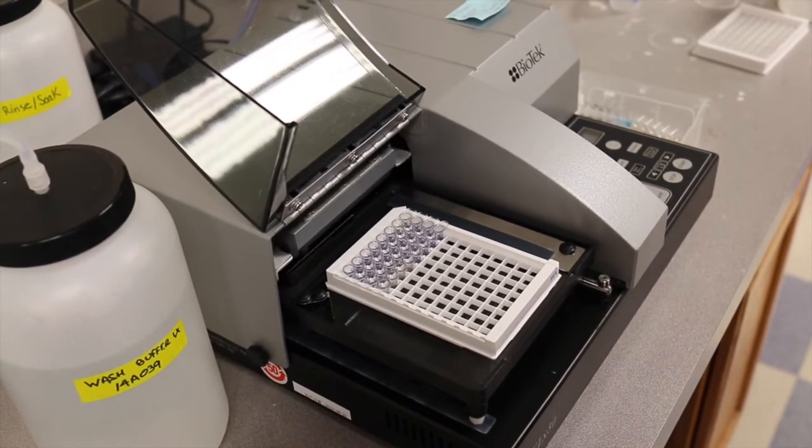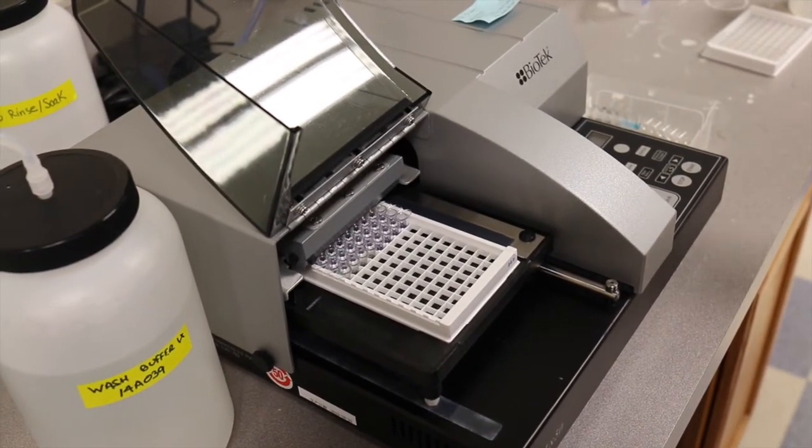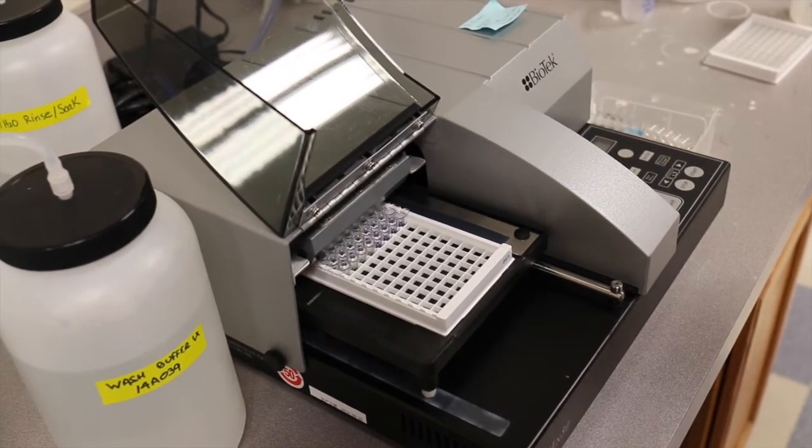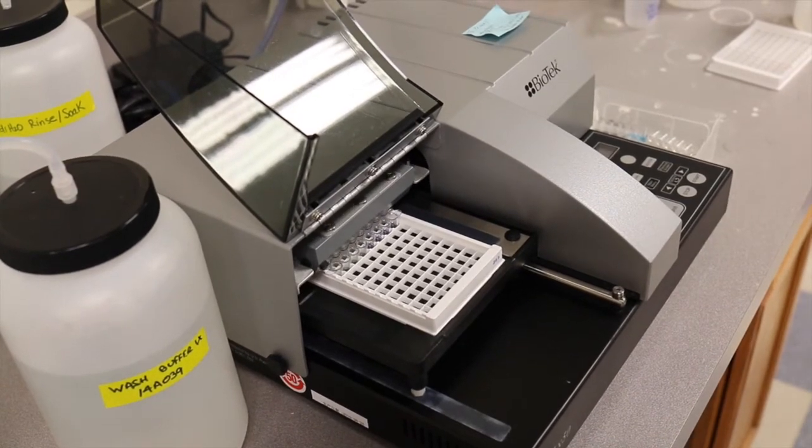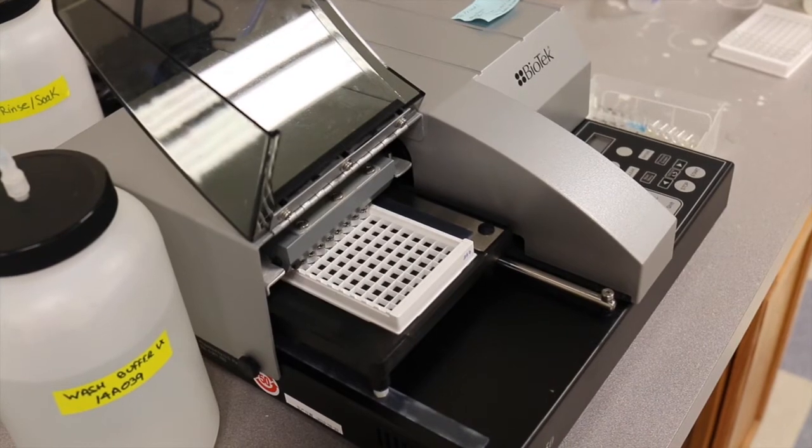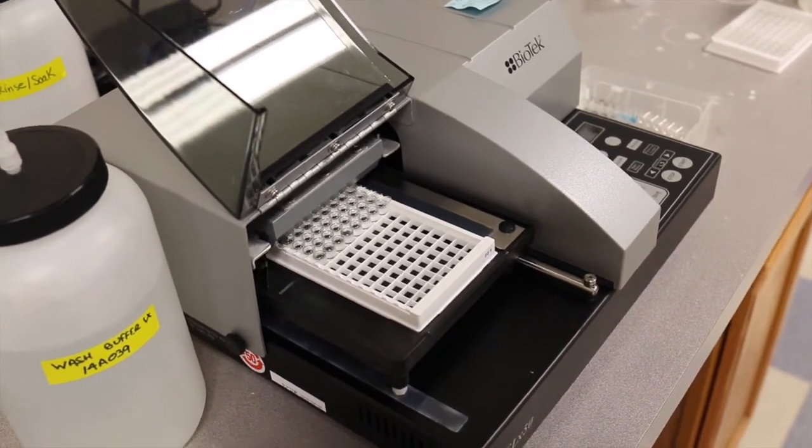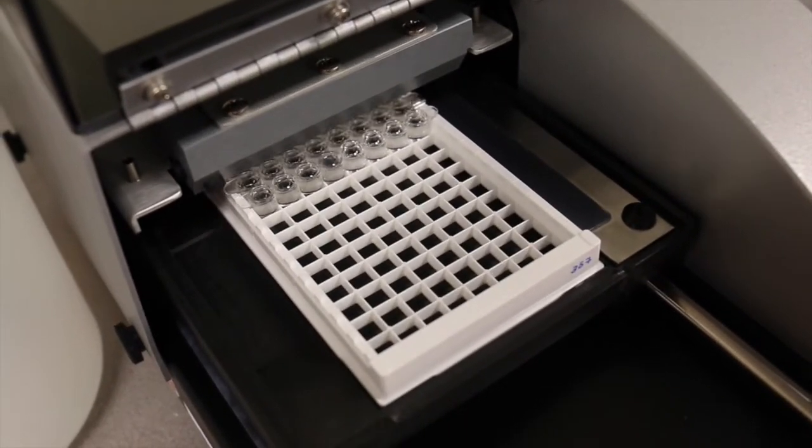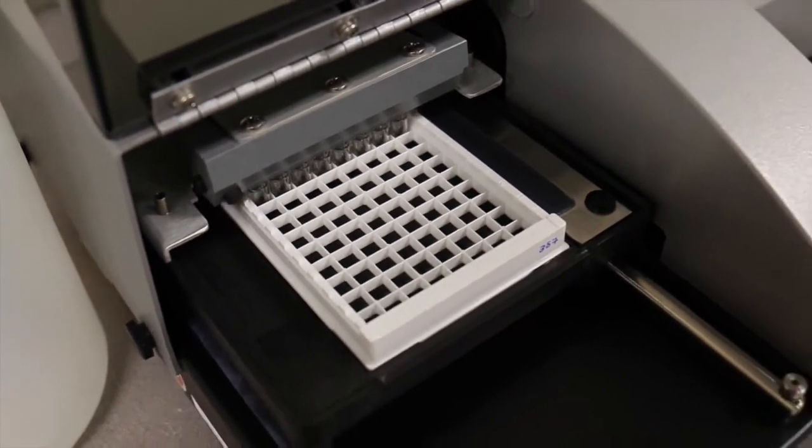Peroxidase conjugates are inhibited by sodium azide, which may be provided in some other manufacturer's wash buffers. Make sure that you thoroughly wash the plate washer with our wash buffer prior to using. If you do not have a plate washer, see if someone else close by does. Make sure that there is no azide in their washer. Remember, azide will inhibit color formation.